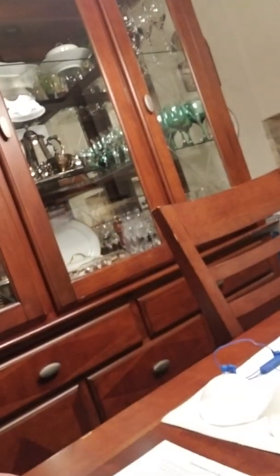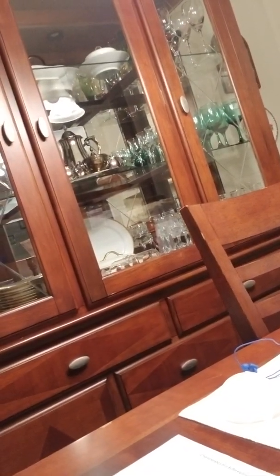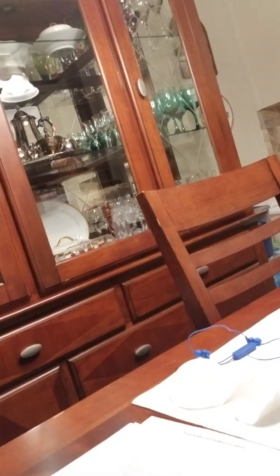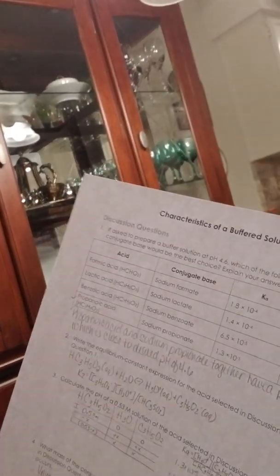So it pretty much ranged from staying consistent all the way to a pH of 10 — basically a base. Here is my pre-laboratory, discussion questions, and laboratory questions that needed to be answered. I will also upload a video and pictures. Thanks.